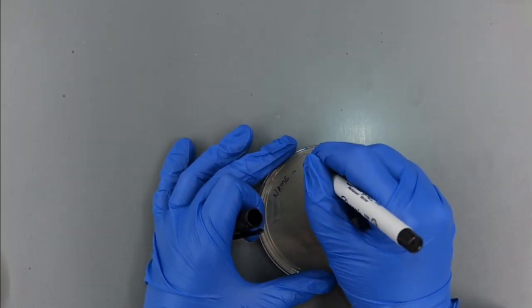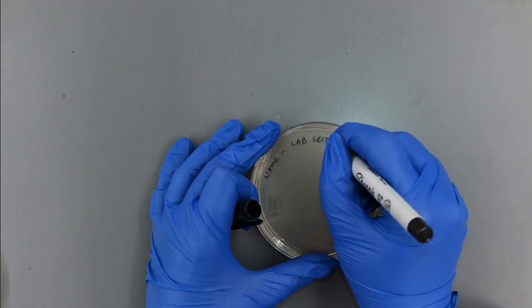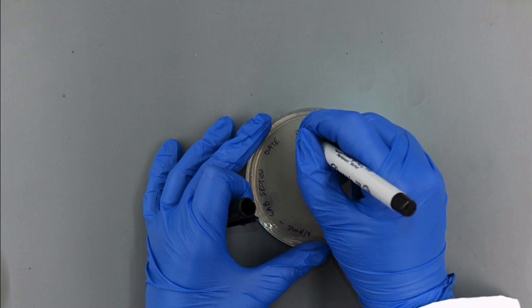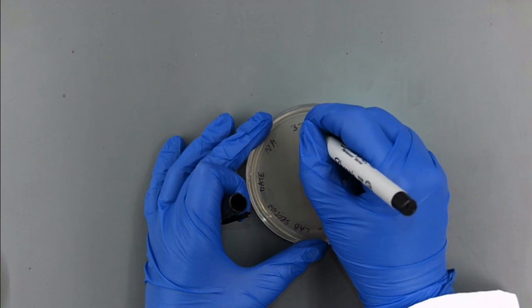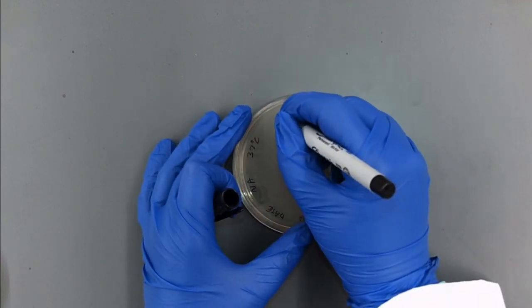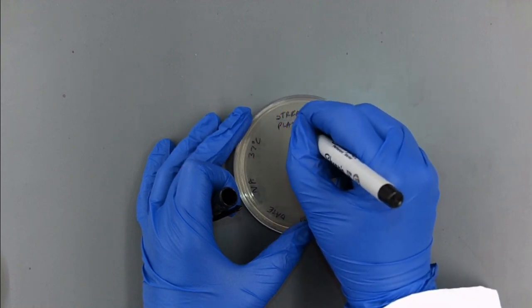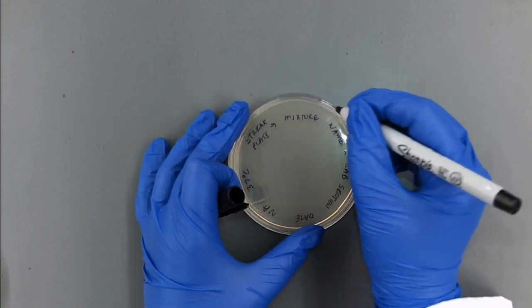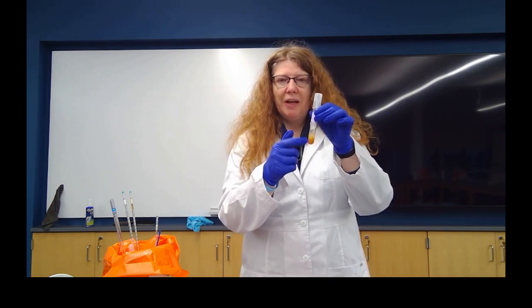The name, your lab section, the date, the type of media, this is Nutrient Agar, the temperature, this will be 37 degrees Celsius, and this is a streak plate from a mixture of bacteria. We're going to take our mixture, and because it's a liquid, we're going to either vortex it or mix it by hand.